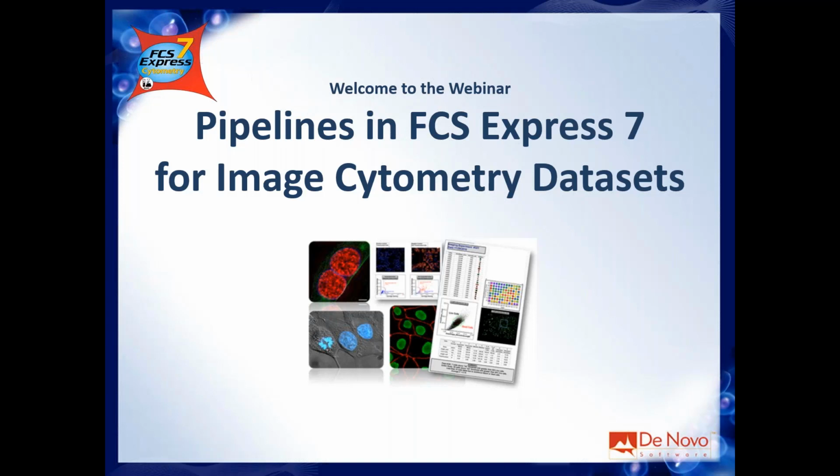So my name is Andrea, and I'm going to present what you can do in terms of pipelines in FCS Express 7 with imaging data.